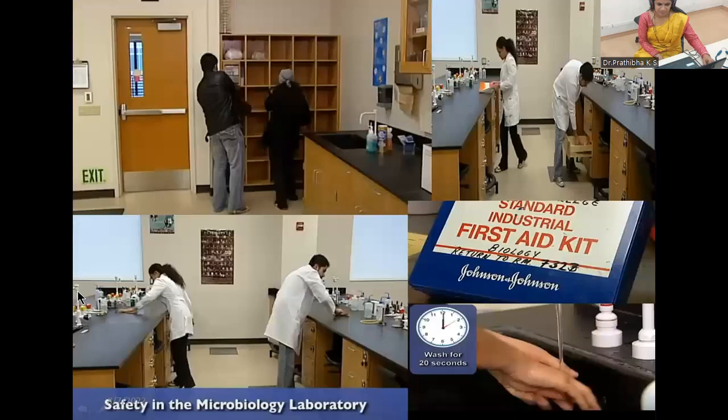Whenever you enter your microbiology laboratory, it is compulsory to keep your books and belongings in the rack. Before doing any experiment, first you need to wipe your working bench area using a surface sterilizing agent, and keep your place clean and well maintained. You should not keep things here and there in the microbiology laboratory. That is compulsory. Whatever things you have taken must go back to their places.